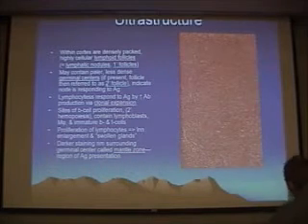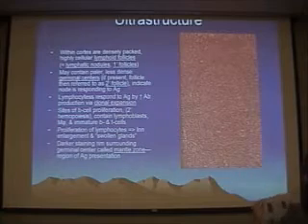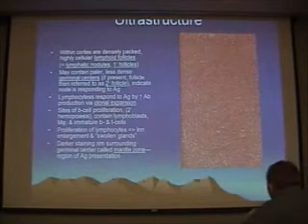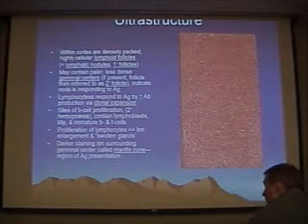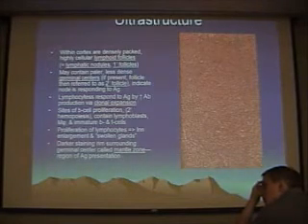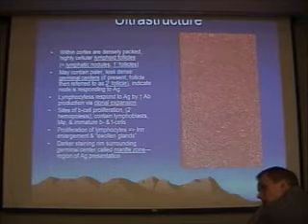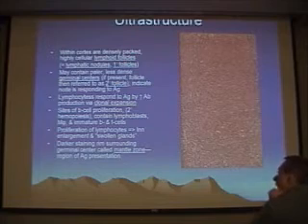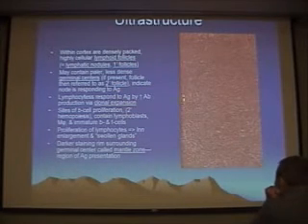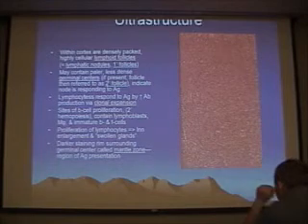If it has a germinal center, that means that node is undergoing clonal expansion. Those lymphocytes, the B cells, have been exposed to antigen. They are gearing up to produce lymphoblasts, which are going to mature into B cells that produce antibody, or plasma cells. And then that region will be surrounded by a thin, darker staining mantle zone, which is a region of antigen presentation.